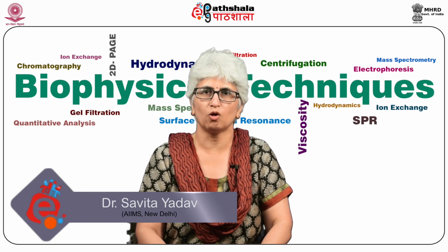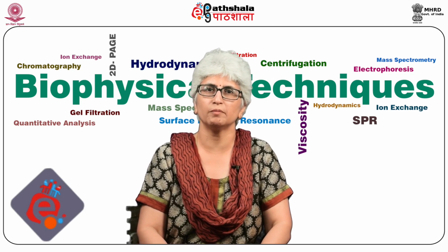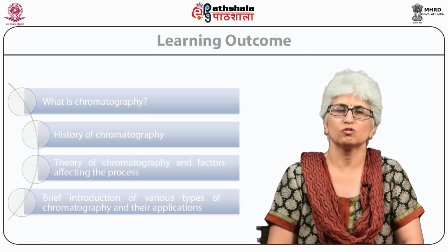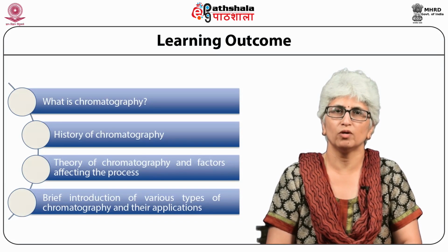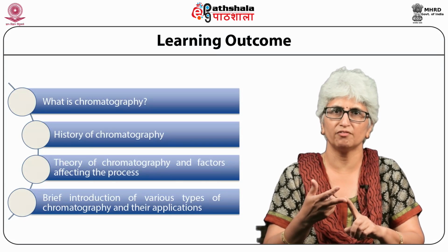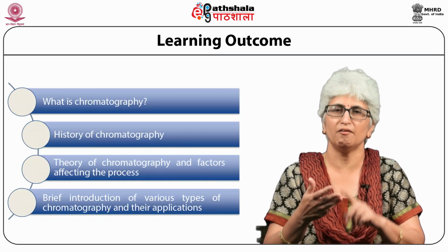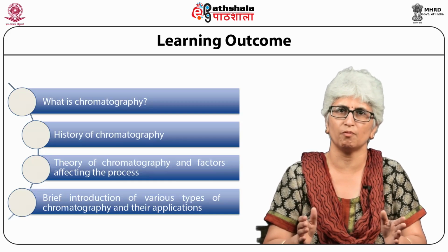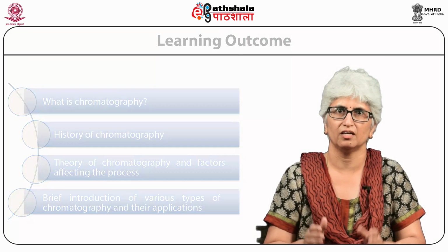Today I am going to talk on module Introduction and Types of Chromatography from paper Techniques in Molecular Biophysics. So students, let's see what are we going to learn from this module. What is chromatography, history of chromatography, theory of chromatography, and factors affecting the process. Brief introduction of various types of chromatography and their application.